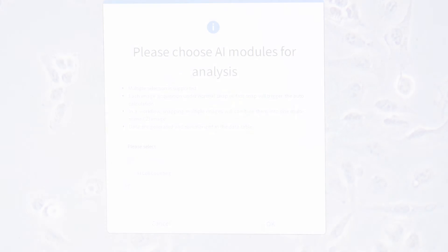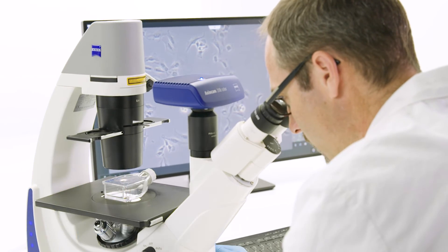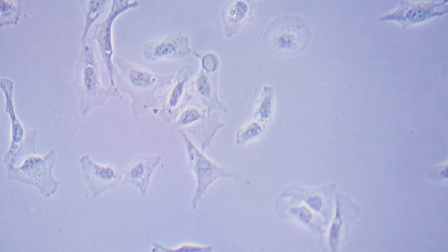Here's how it works. Start by selecting the cell counting module in Zeiss LabScope. Now you're ready to focus your sample.